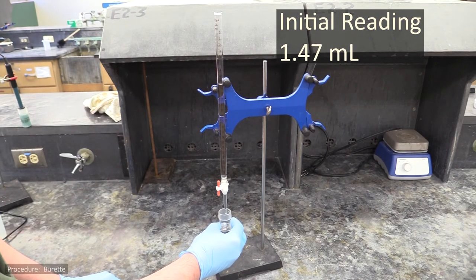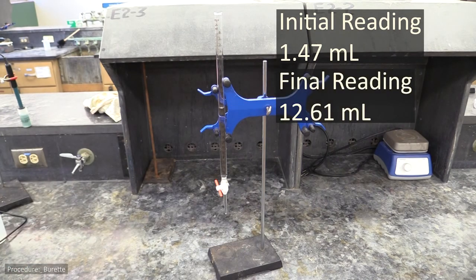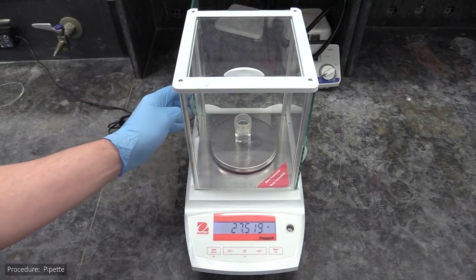You'll then dispense about 11 to 13 milliliters of water into your weighing bottle and take a final reading, again to the hundredths place. You can then calculate the volume dispensed by subtracting the initial reading from the final. Finally, re-weigh your weigh bottle with the water inside.